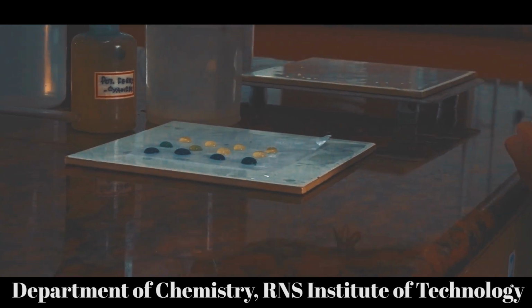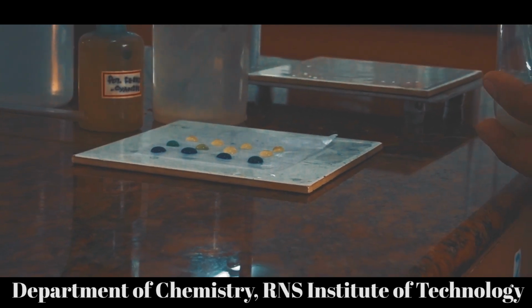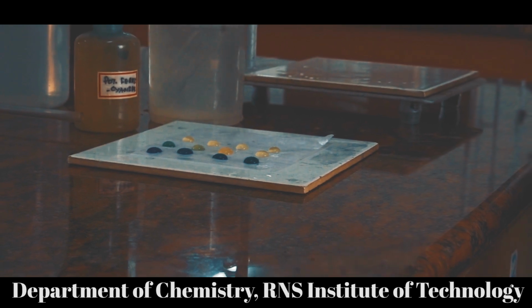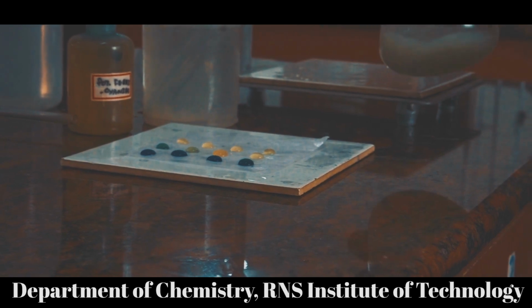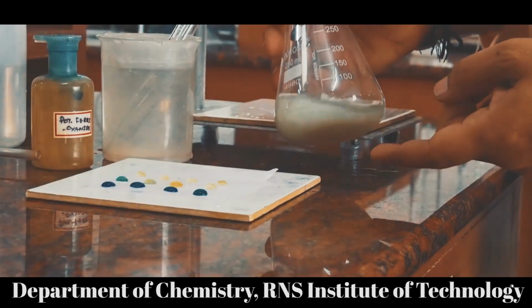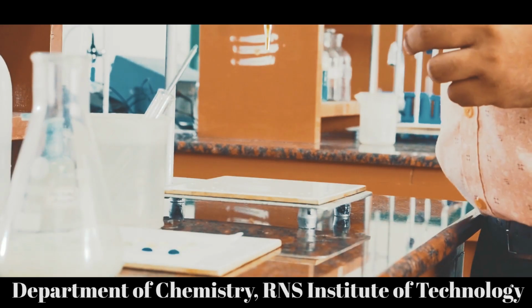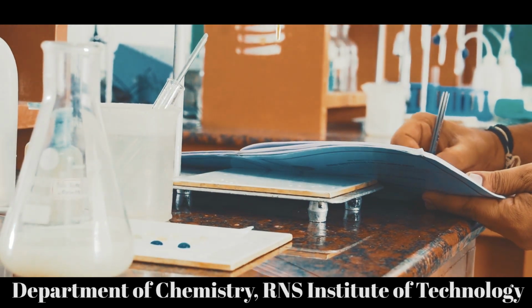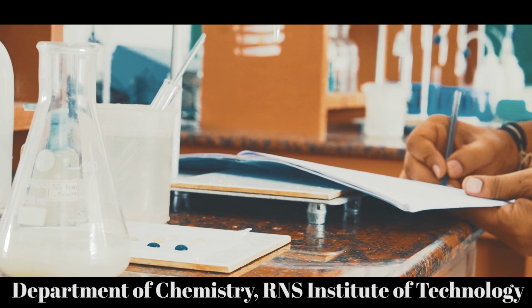This time you can check. See, the indicator fails to change its color to blue, right? So this indicates that there are no Fe2+ ions in the solution. All the Fe2+ ions are oxidized to Fe3+ ions. So you just have to note down this burette reading. For the first trial, the final burette reading is 13 ml. Initial is 0, so final minus initial is 13 ml.